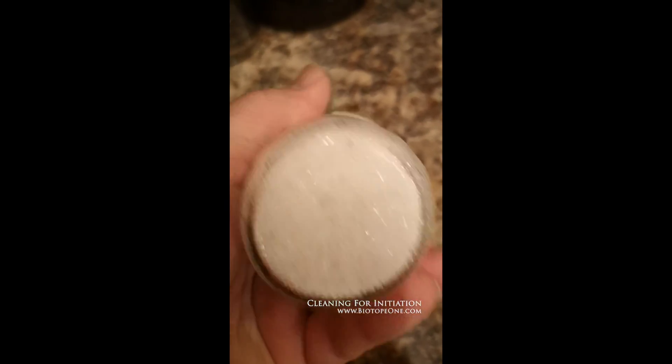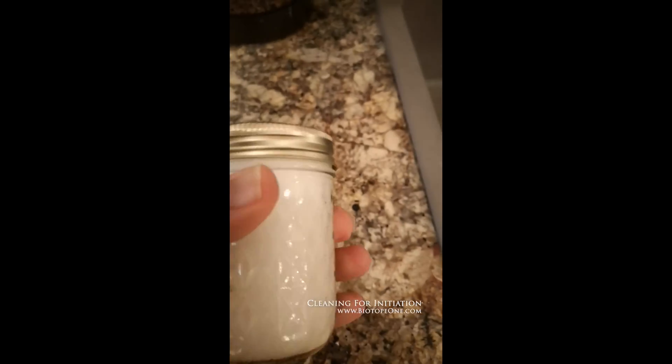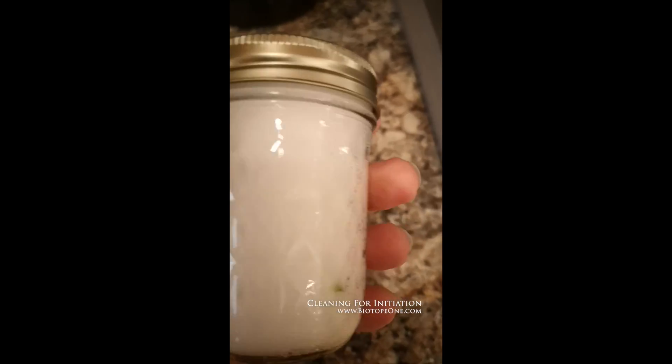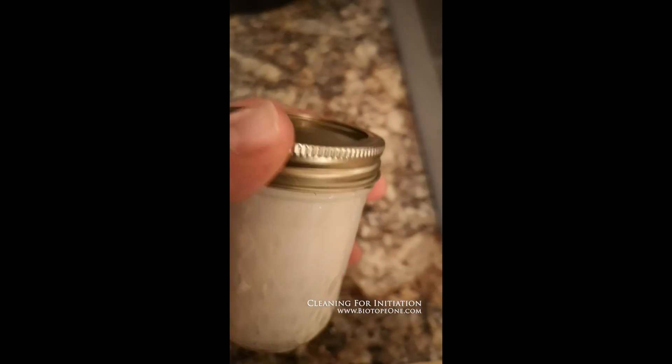I don't have a tumbler anymore — I sold it when I moved to Germany from Seattle. I don't have any of my stir plates, hot plates, magnetic stirrers, none of that stuff. I have to do everything by hand now and I don't want to re-buy everything. There are some workarounds to not having that fancy equipment, and I guess it's low tech — I'm doing this by hand with a mason jar.